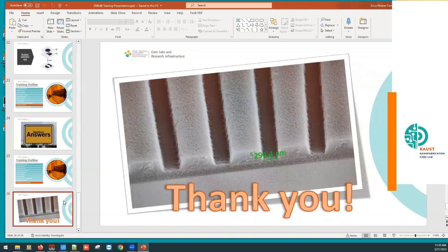So here, I just wanted to put a picture of one of the samples that we did during the acceptance test of the tool, so we can prove that we can reach 300 nanometer lines. And that's it. Thank you for your attention.